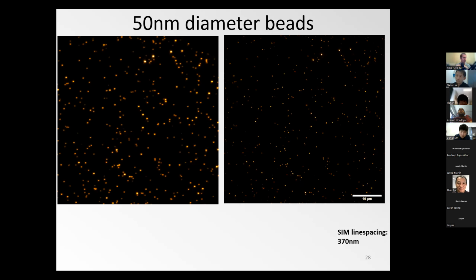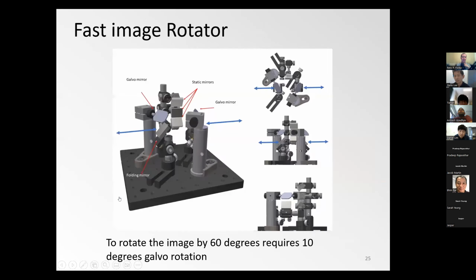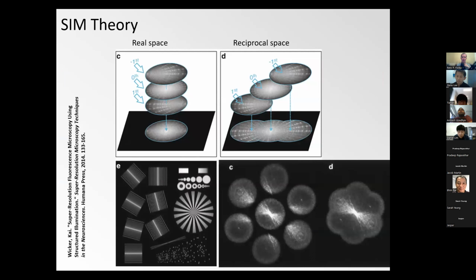I think other groups have also tried that by other means of creating different views, but this already existing anisotropy can be taken out. And then, without going too much into the details, the OTFs are also not perfectly round because of that. You can imagine if the PSF is elliptical, the OTFs are also a bit elliptical. And so when you stitch them together, maybe the gap widens a bit compared to the case where they're perfectly round. So yes, in a sense, one could make the argument you could add more rotations. We simply do not want to, because it would obviously lower the speed.